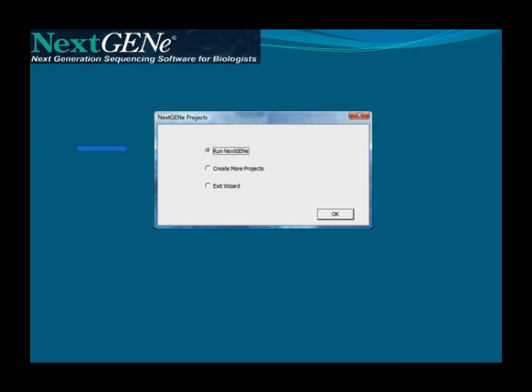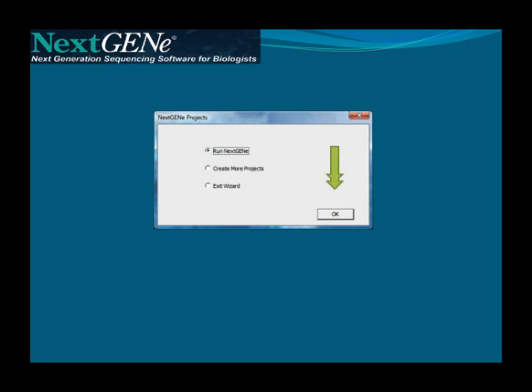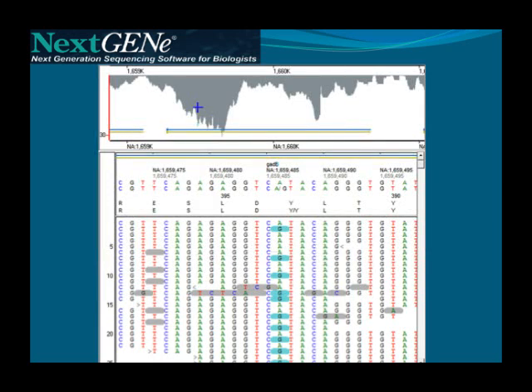After clicking Finish, you can choose to run the project immediately, or set up additional projects for batch processing. Once you've selected one of these options, click OK. When processing is completed, results are automatically shown in the NextGene viewer.